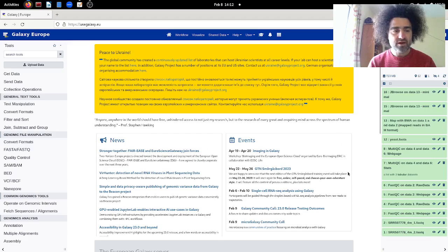So just to summarize all this, when you first use Galaxy, create a user, register and then login. And you should log in because then you are allowed to save histories here. On your left hand side are the tools. In the middle, we will be able to specify parameters for the tools when we use them. We will see that later. And on your right hand side is the history of the steps that you have performed already.